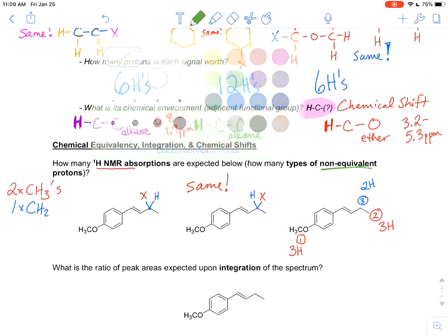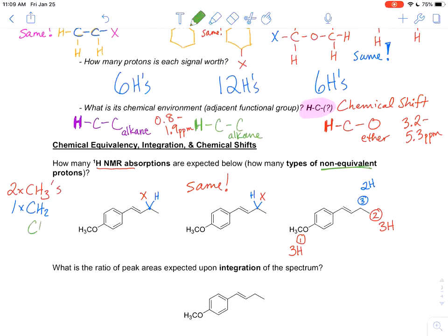All right, so the fun really begins when we look for all the different CH groups. So now I'm going to add in 1 hydrogen at a time. So the rest of the carbons in the molecule have only 1 hydrogen attached, with the exception, before I get into it too much, of these two carbons, which have no hydrogens, so we would expect no signal for them because there are no hydrogens. That's kind of all there is to it.